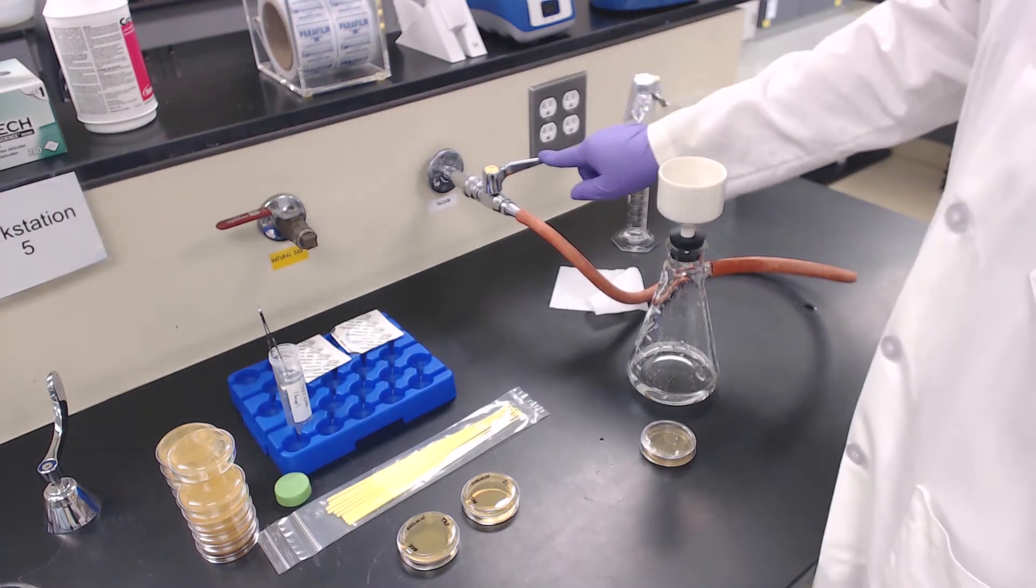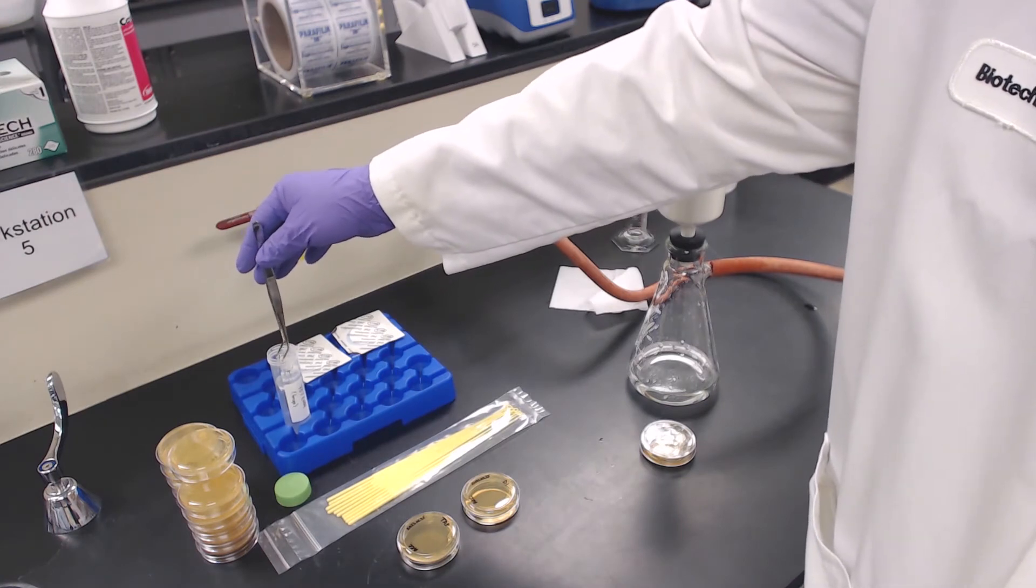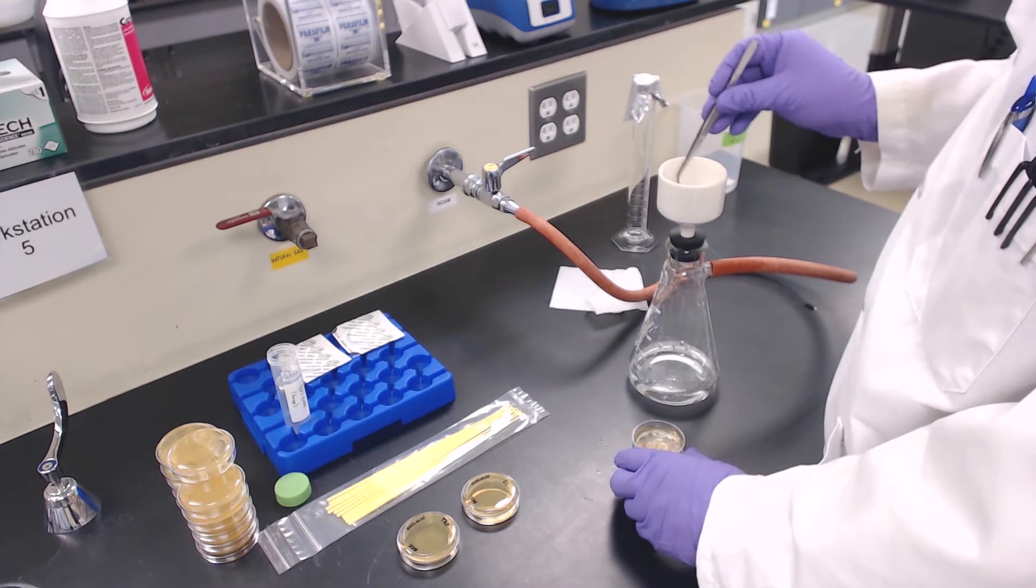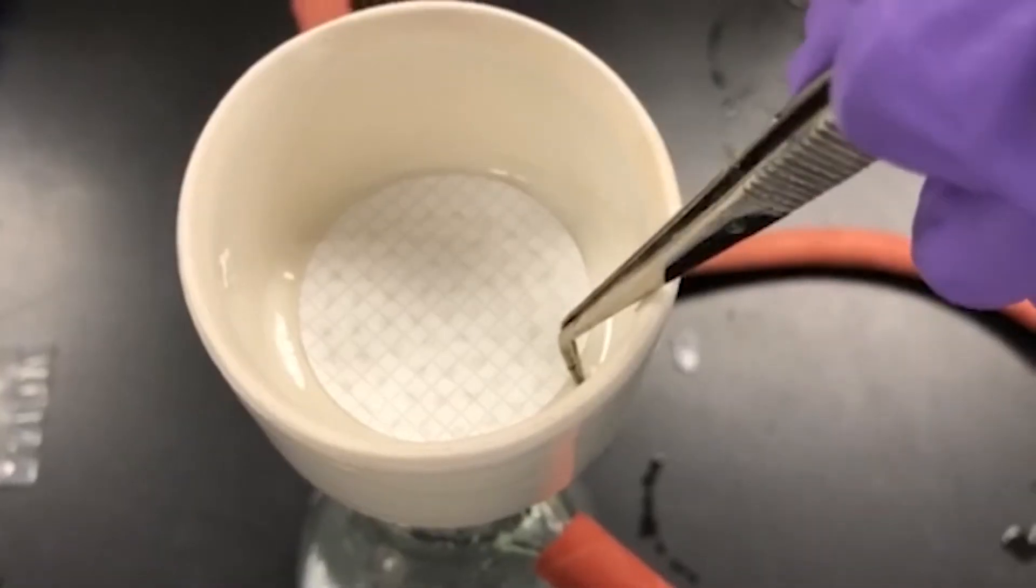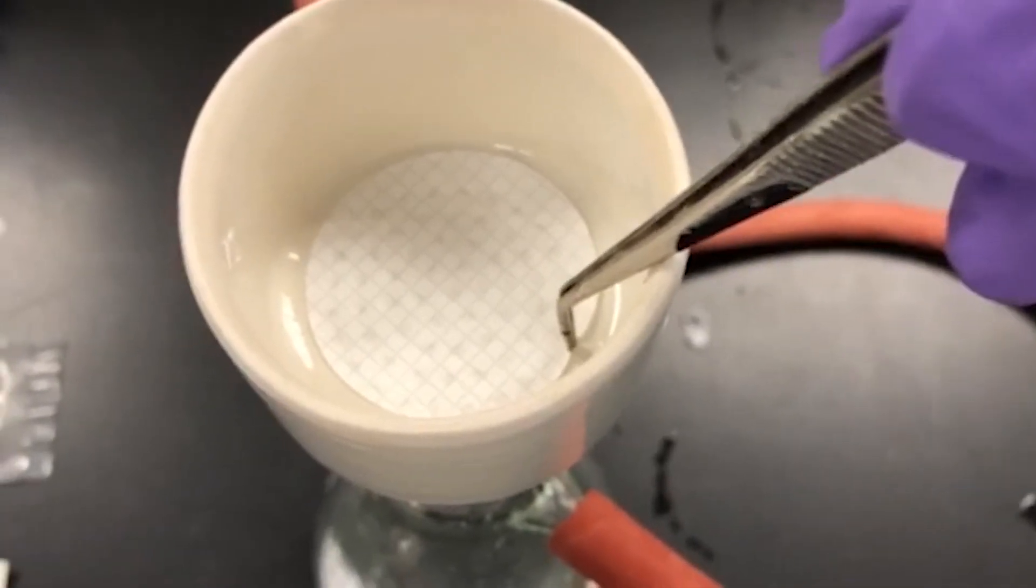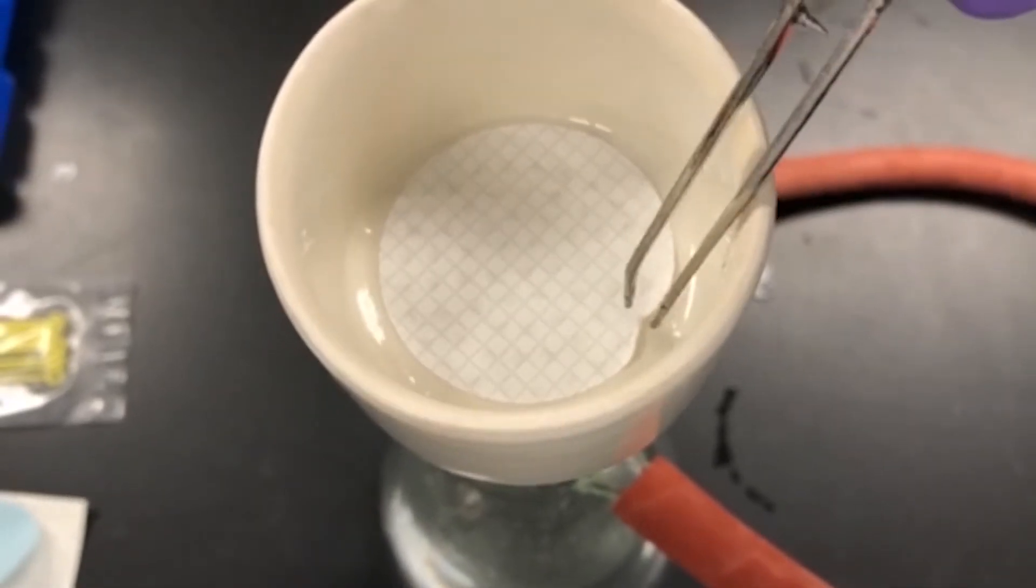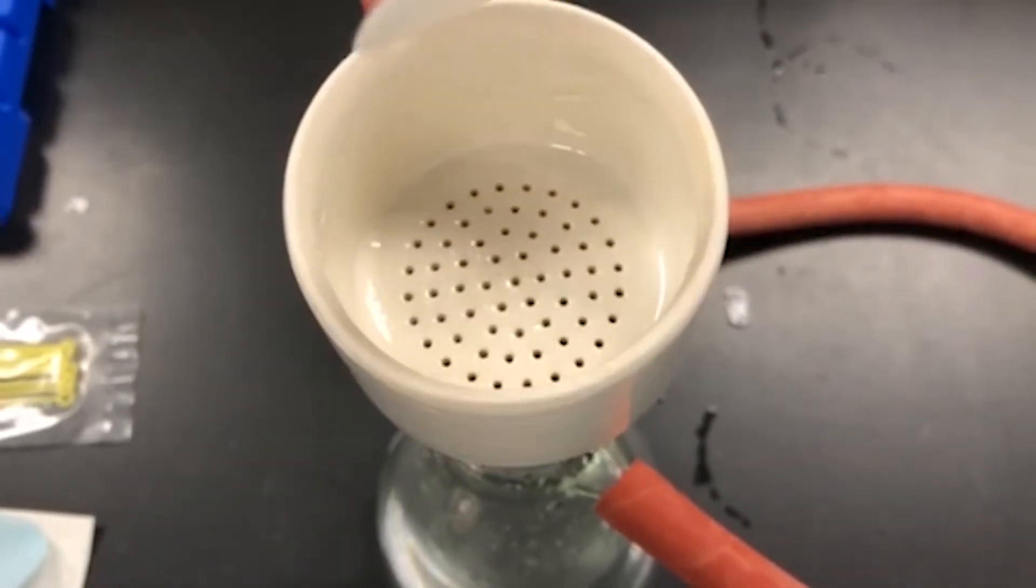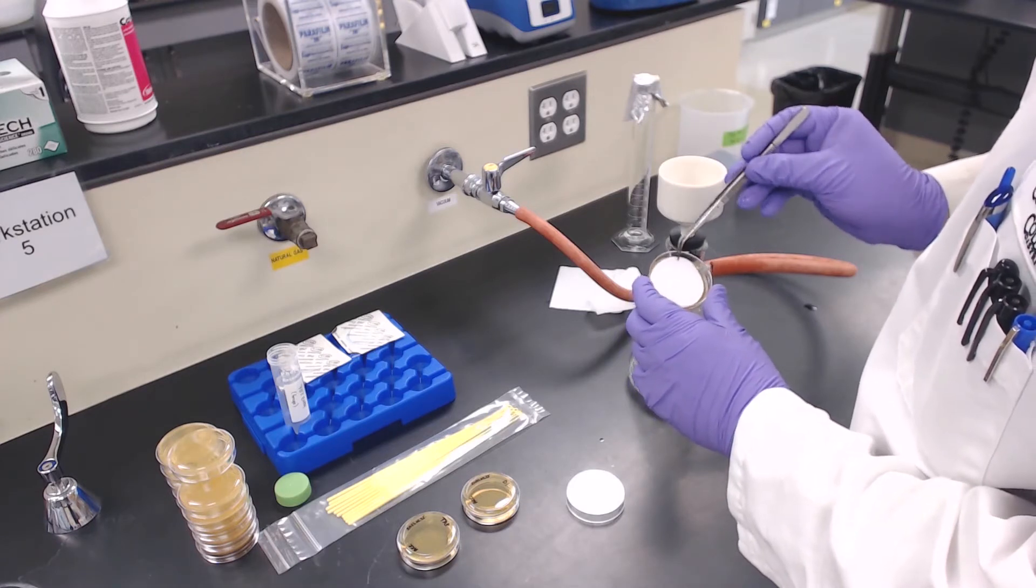Turn off the vacuum. With sterile forceps, retrieve the filter paper from the funnel. When removing the filter paper, slowly lift from one of the edges. This will prevent any tearing if there's still a vacuum behind the filter paper. Place the filter paper grid side up on the corresponding petri dish.